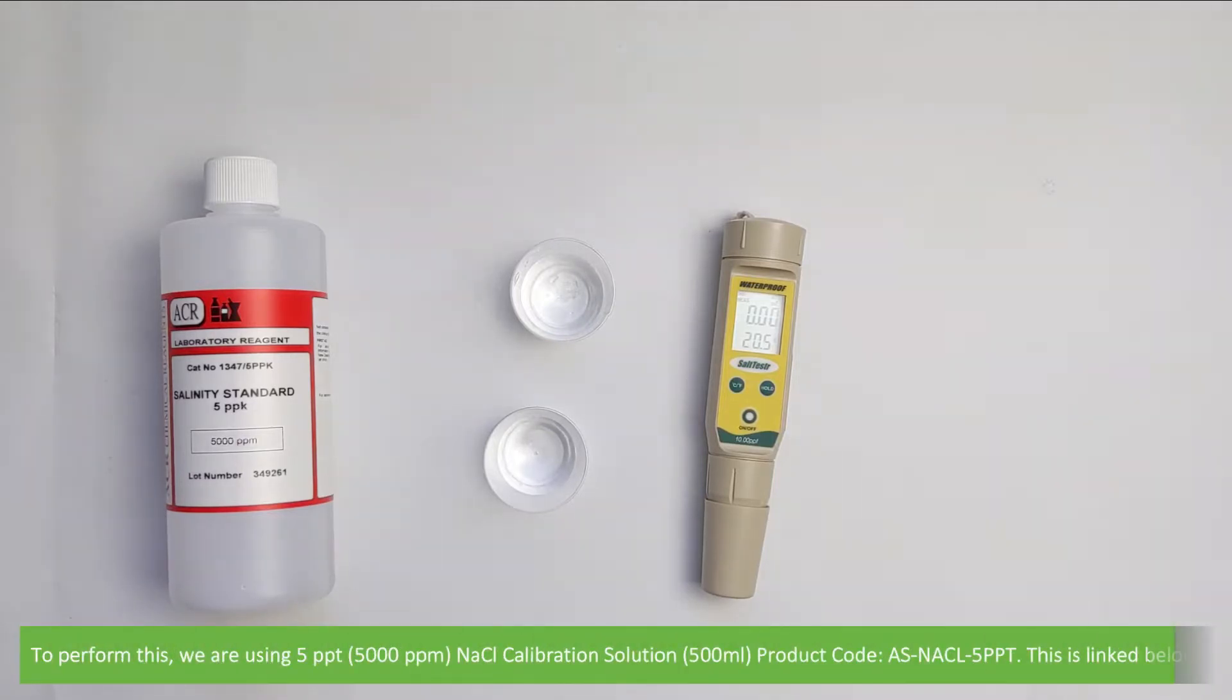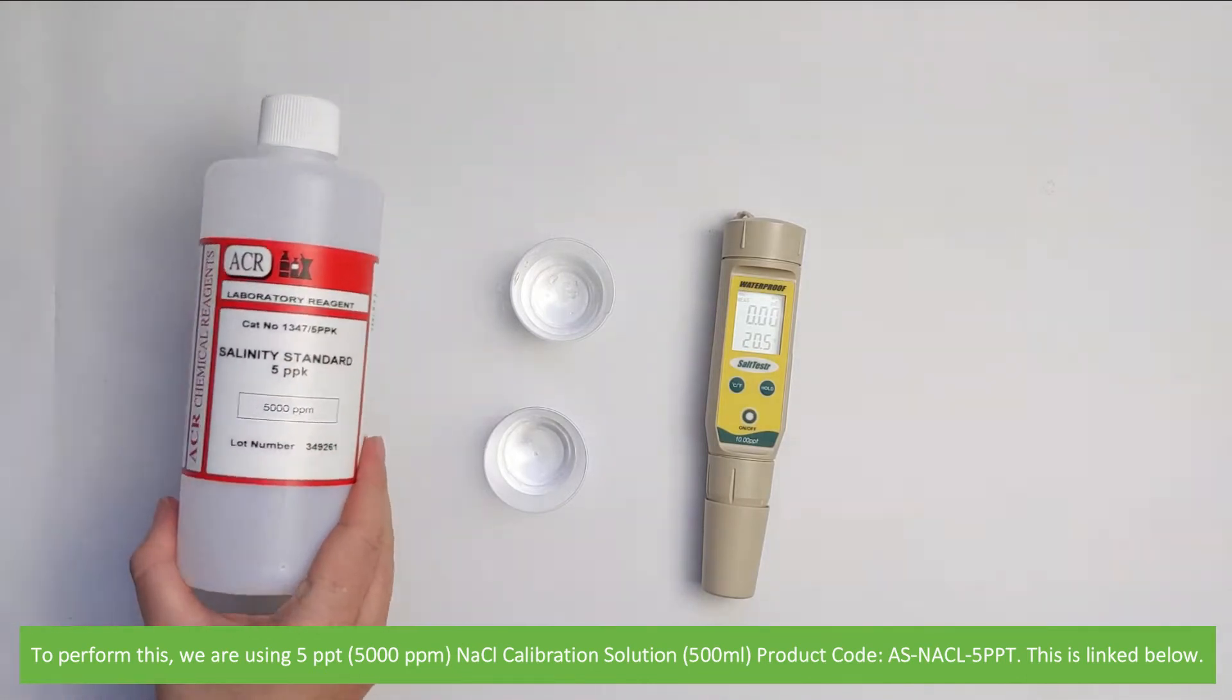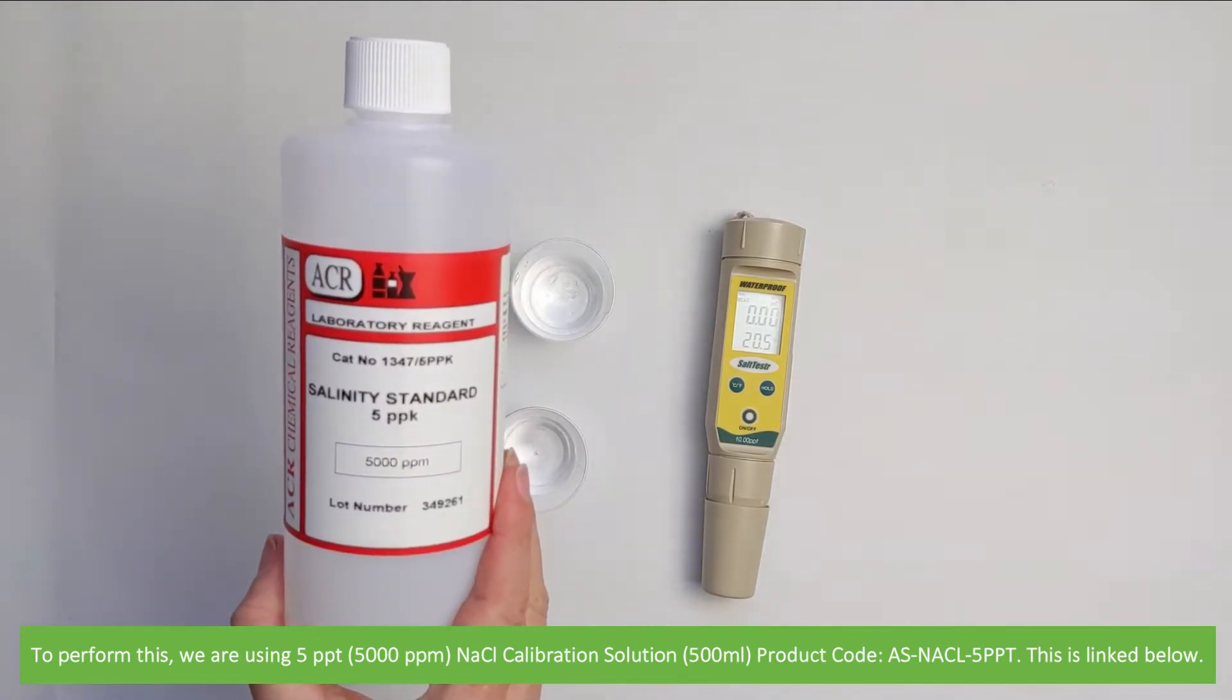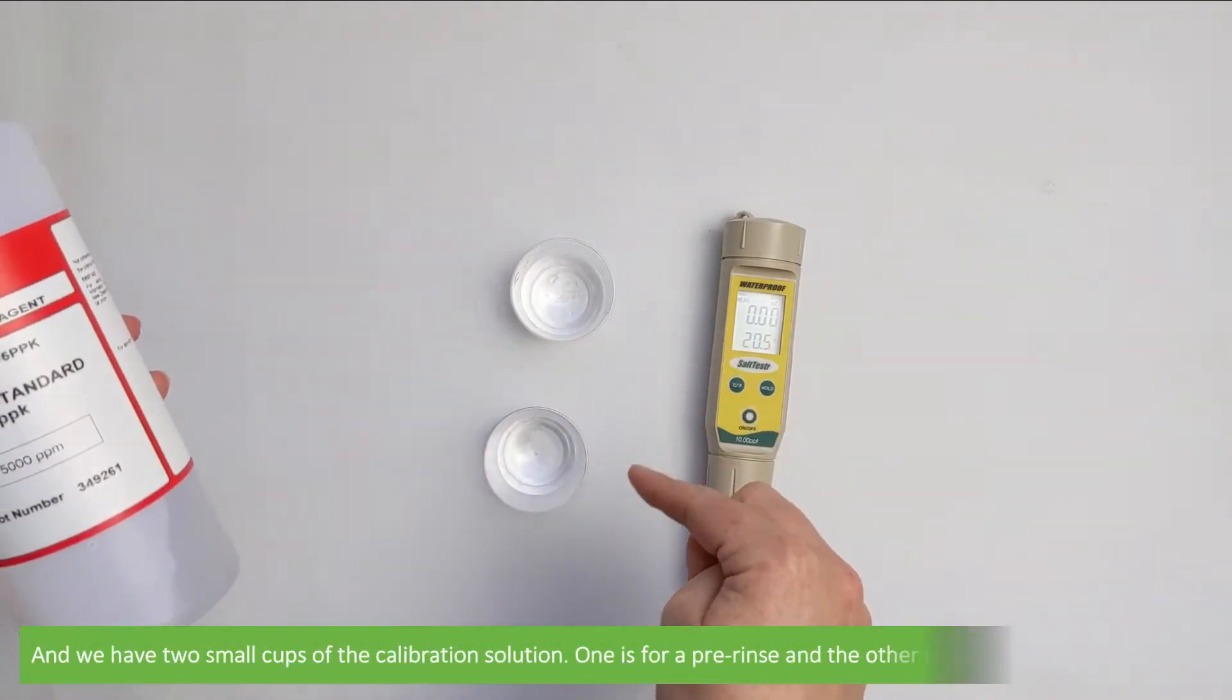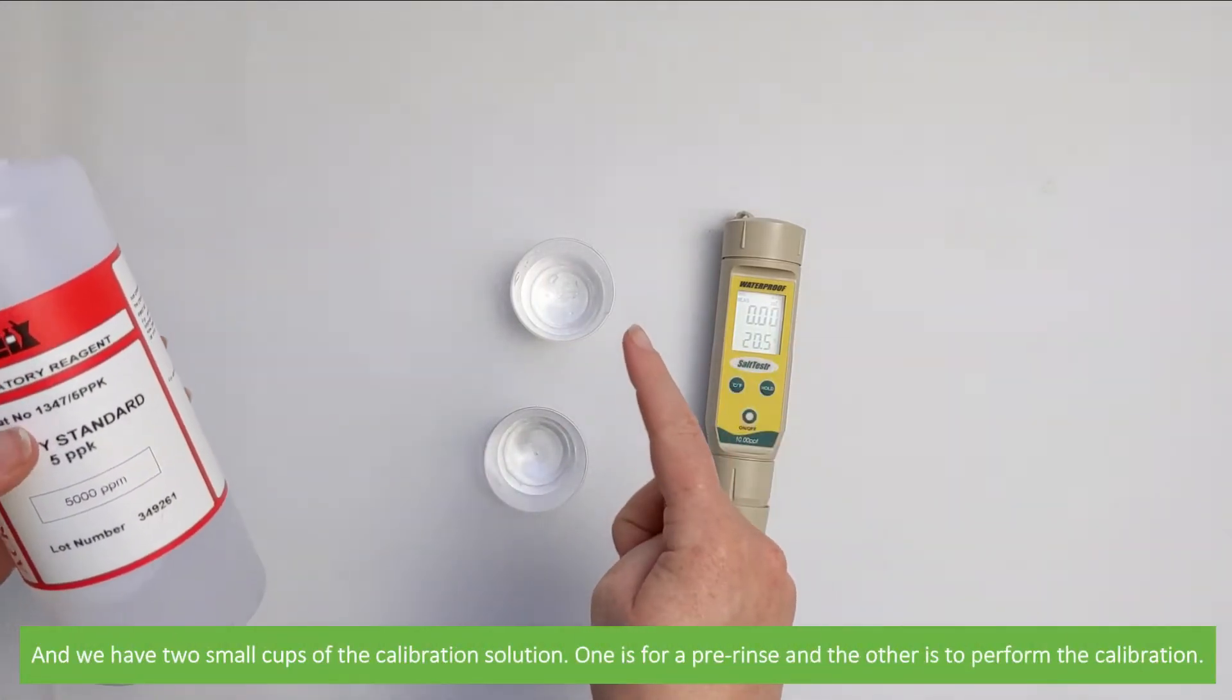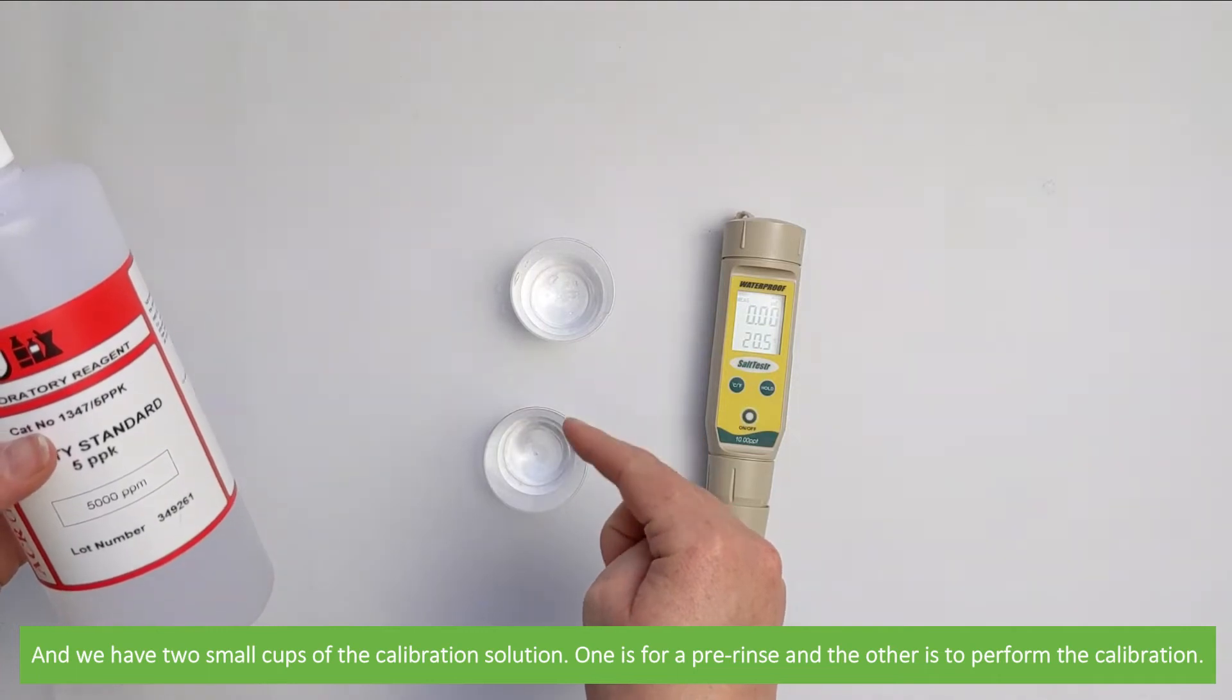To perform this we're using 5 PPT sodium chloride calibration solution in a 500ml bottle. The product code is ASNACL5PPT, this is linked below. We have two small cups filled with the calibration solution: one is for a pre-rinse and the other is to perform the calibration.